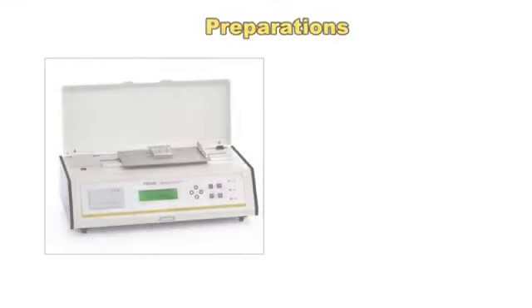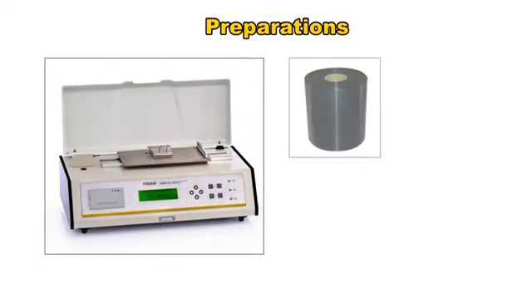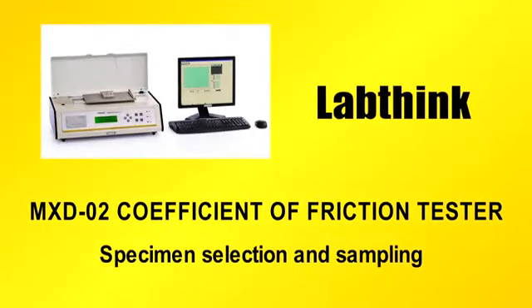Preparations. MXD-02 coefficient of friction tester. Specimens: knife, ruler. Specimen selection and sampling.